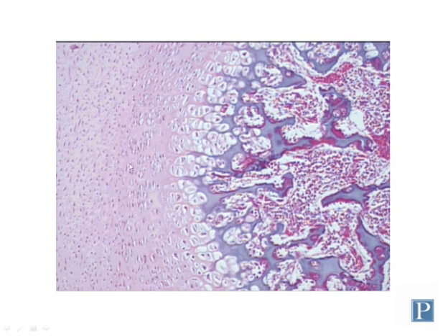Here you have the zone of proliferation. Here you have the zone of hypertrophy. Here you have the zone of calcification and cell death, where the matrix becomes a darker purple. And then here we start seeing eosinophilic matrix. This is the zone of ossification and resorption.